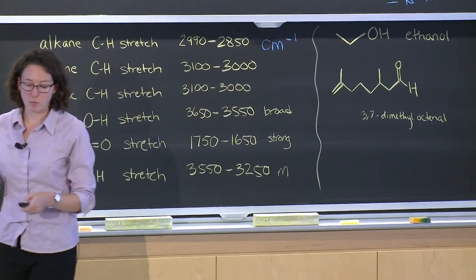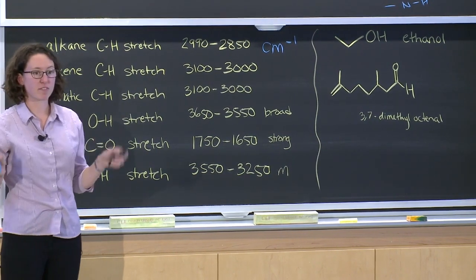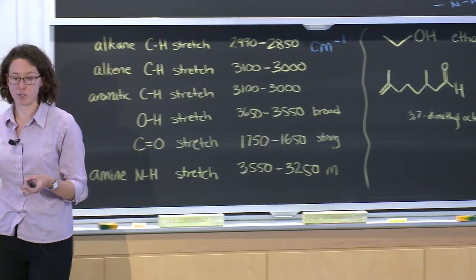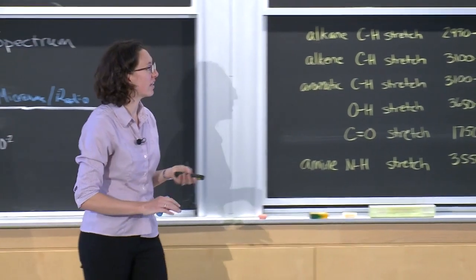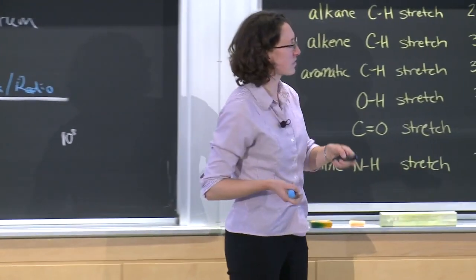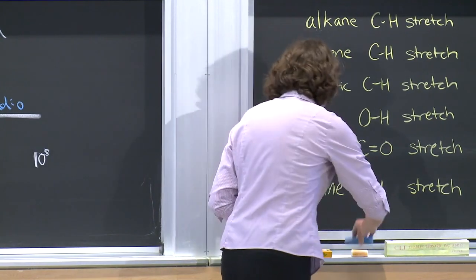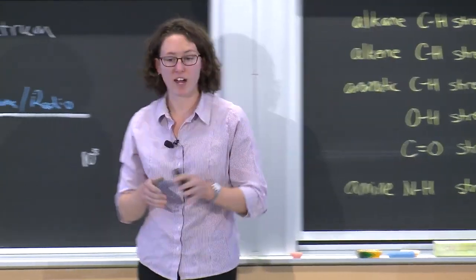So we'll go over this a little bit more also when we talk about the ester lab, because you're going to be using IR for that lab as well. We can talk about some of the different functional groups that you can see in that case, because we're going to be dealing with, obviously, esters and some alcohols and some ketones, and some carboxylic acids. So that is a brief overview of IR.